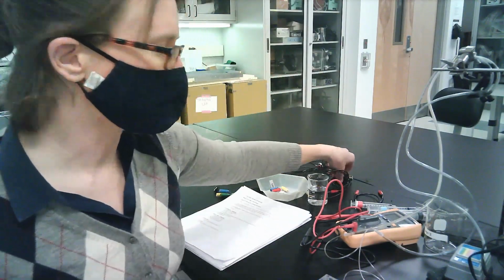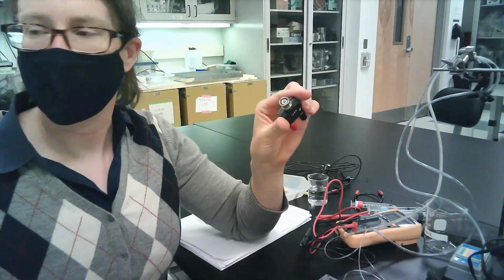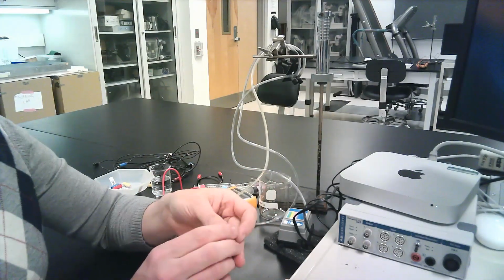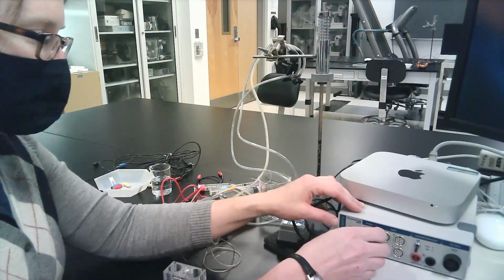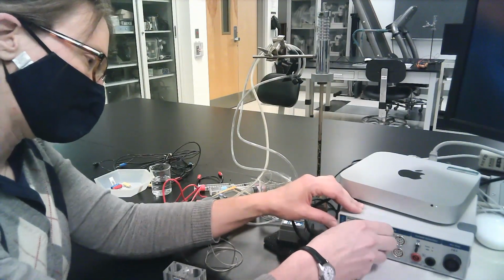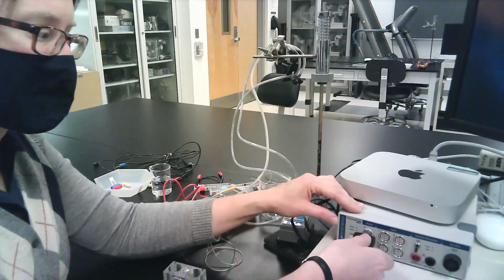So I'm going to start actually at this connector. This is a BNC connector. Okay, so this BNC connector is going to connect up to the positive output here on the PowerLab unit. And that kind of twists on, so it's a slightly different connector type.